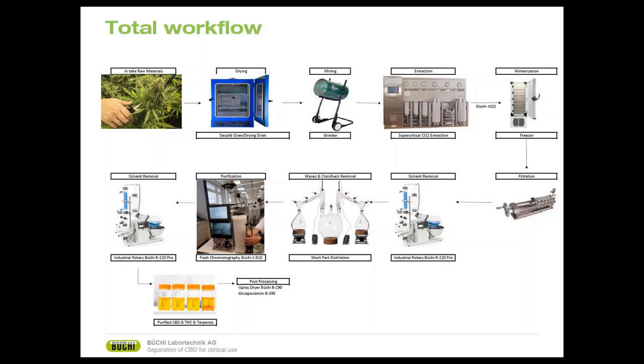As we mentioned, first of all, we must have cultivation or buy the plant from the producer. Next step is drying, and then we grind the plant into the buds for the fine particles and get it ready for the extraction. This is done because when we do the grinding, milling, then we will be increasing our surface area. So more surface area means better extraction. And then extraction is done. After extraction, winterization and filtration is done to remove the waxes extracted from the plant. During winterization, ethanol is used to precipitate the waxes to the bottom.